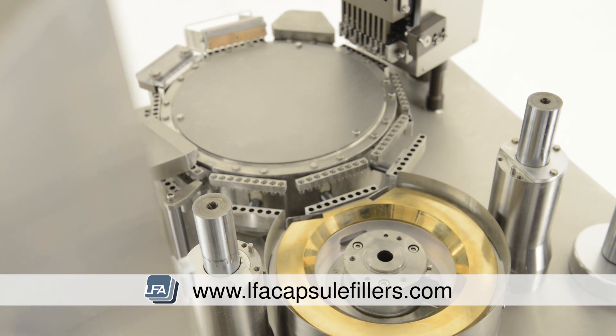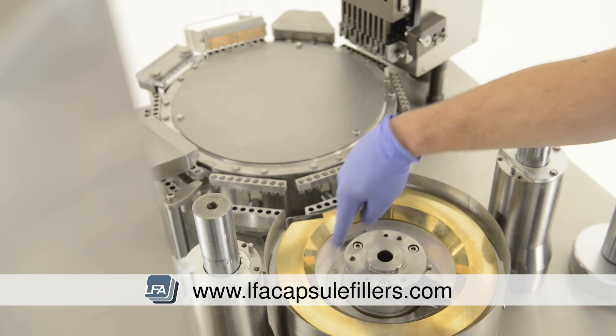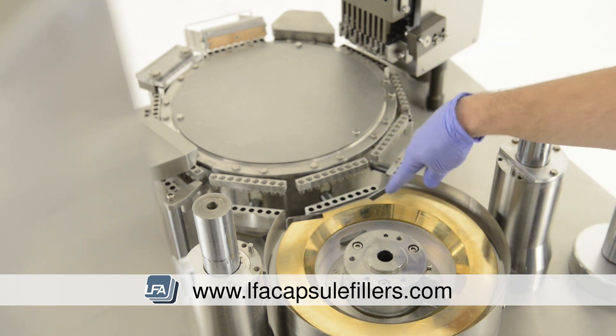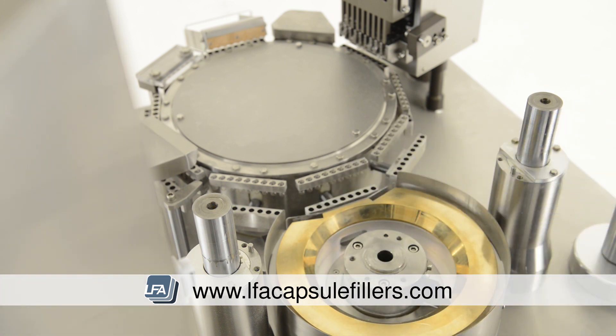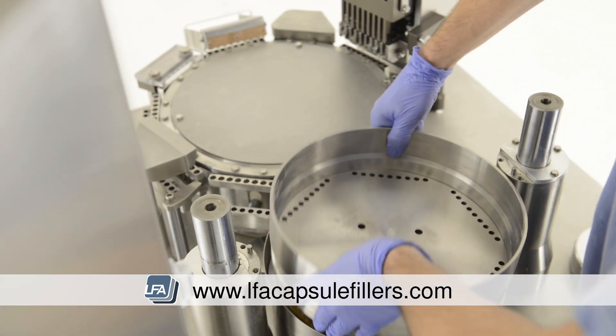While you're in this section of the machine, we suggest cleaning. The FACF does have a powder that pushes out reject powder, but if your powder is fine it may stick around the edges. It's also advisable to check wear around the brass ring. We suggest doing this for every one to two million capsules, especially if your powder is very coarse.